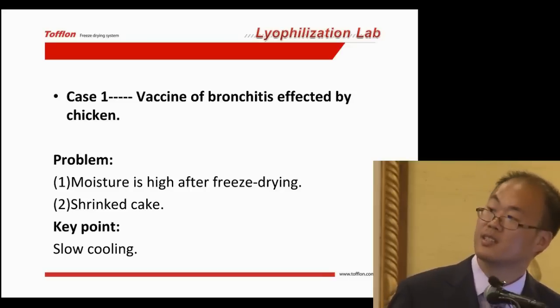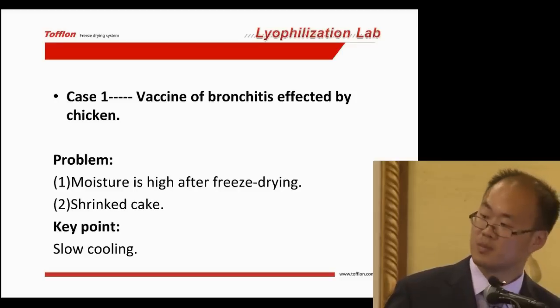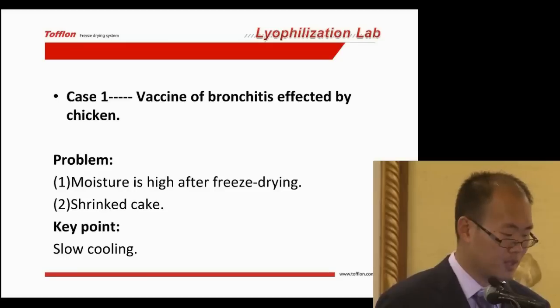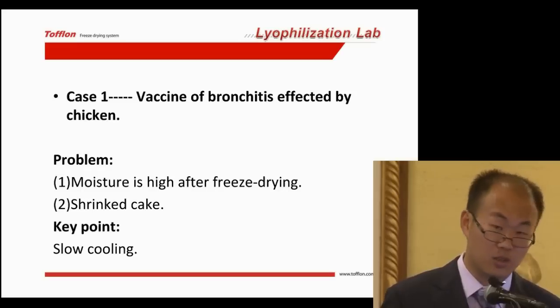It's shrunk, just as this one. So through the freeze drying cycle, we can solve this problem. The key point of this problem is slow cooling.